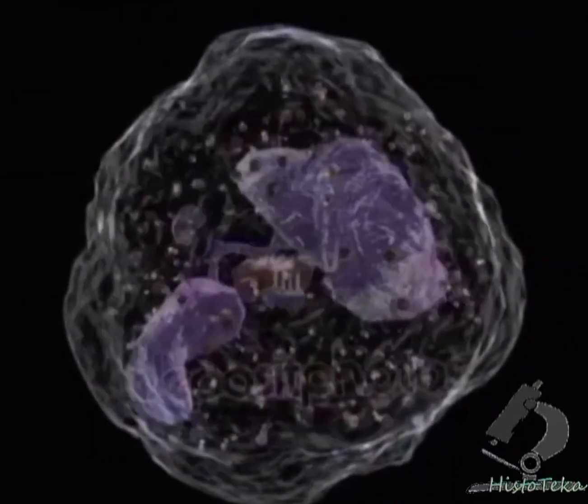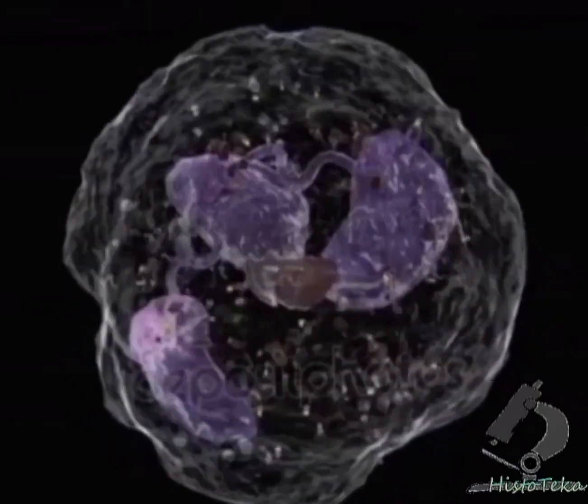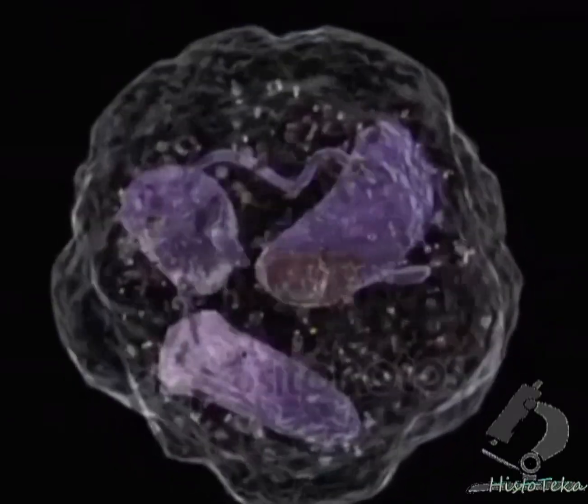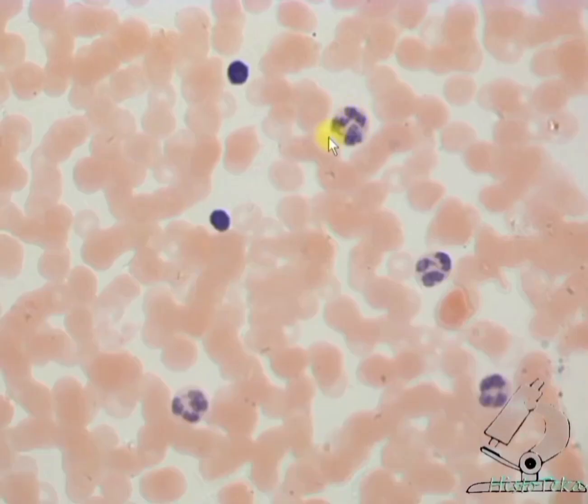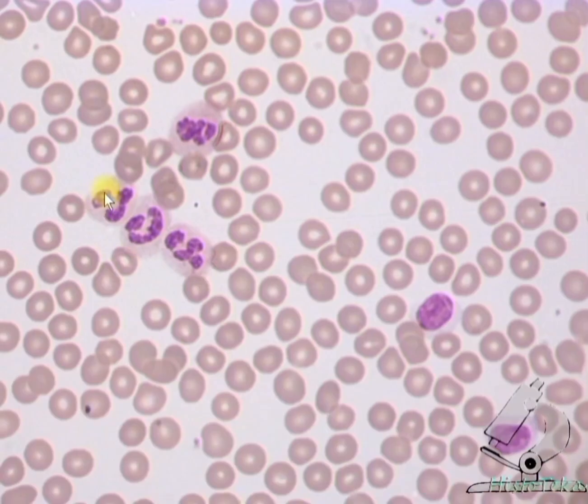That means they consist of several lobes connected to each other by thin bridges: neutrophil, nuclear lobes, and bridge. Neutrophil, 3 lobes, bridges between them. There are 3 lobes visible in this one, and in this, 2 lobes of the nucleus, 2 lobes, 3 lobes.